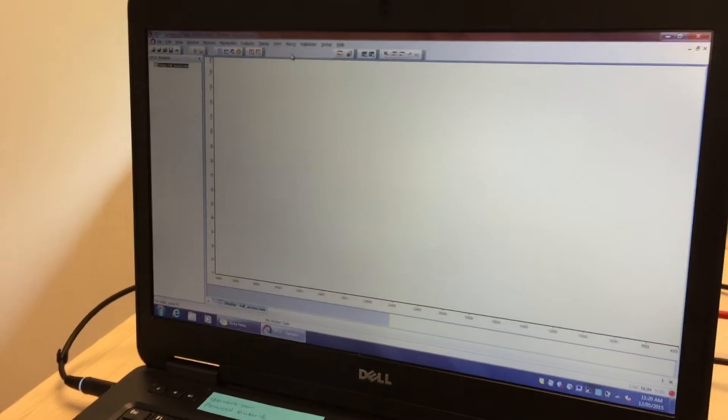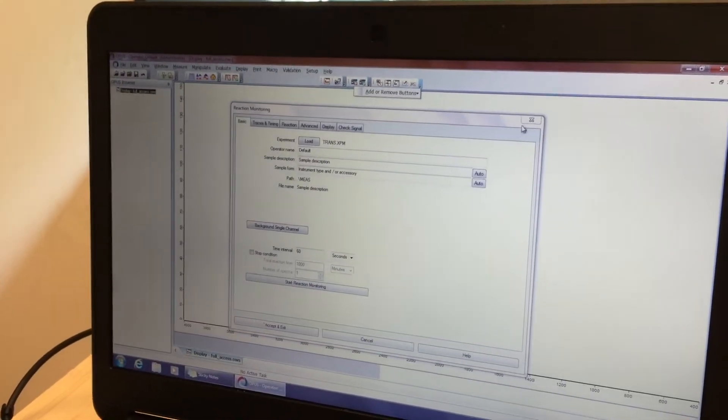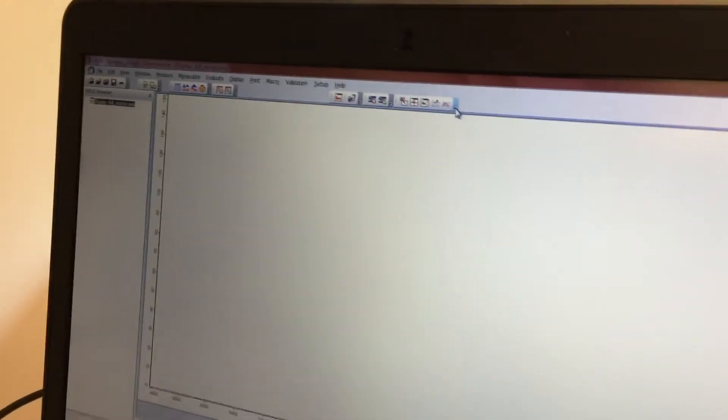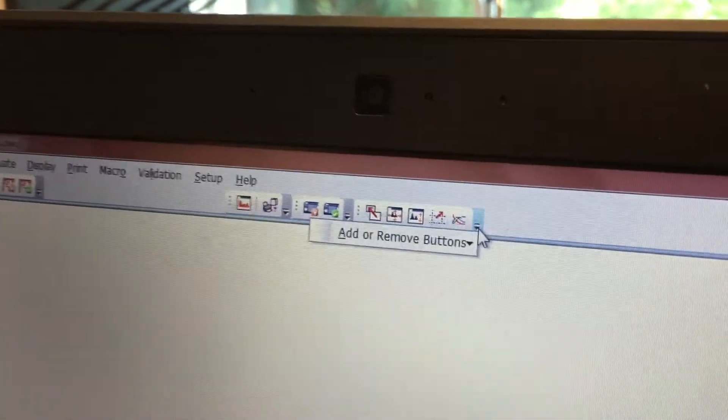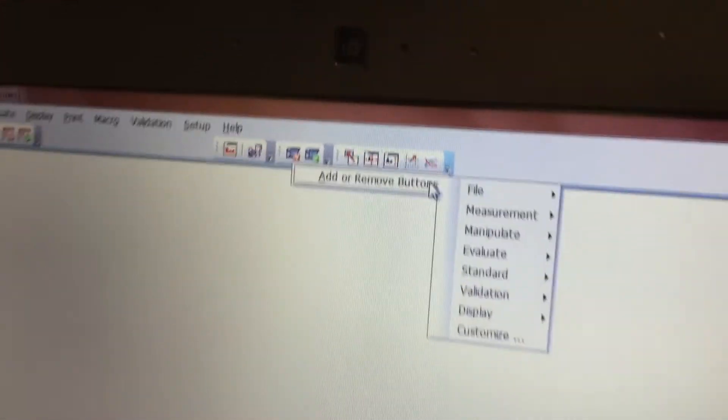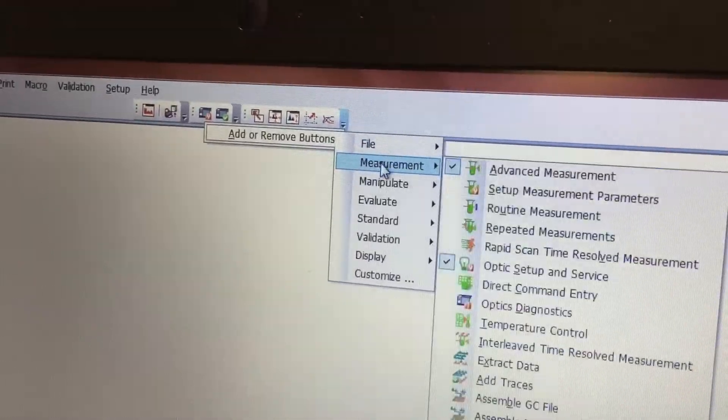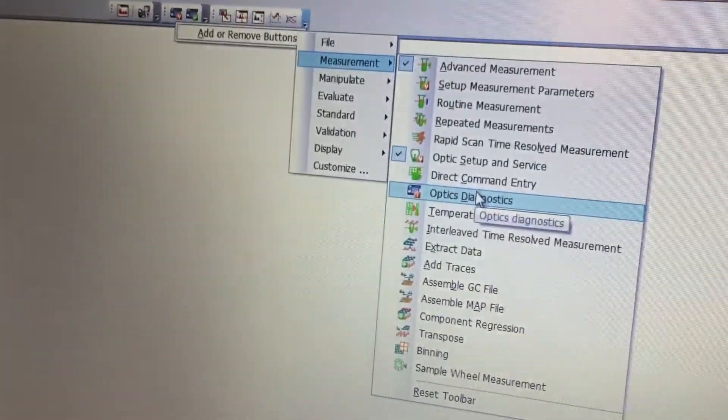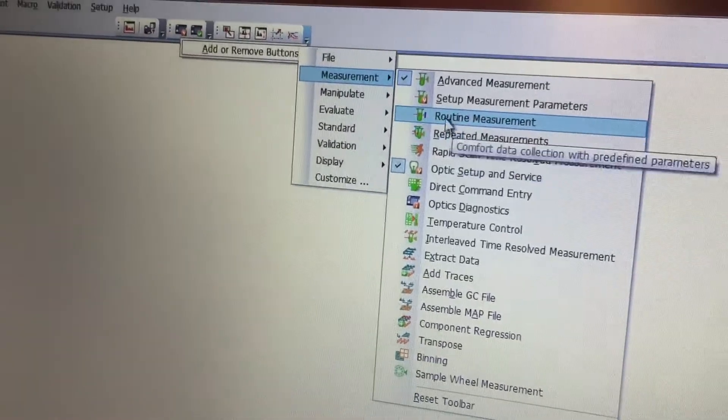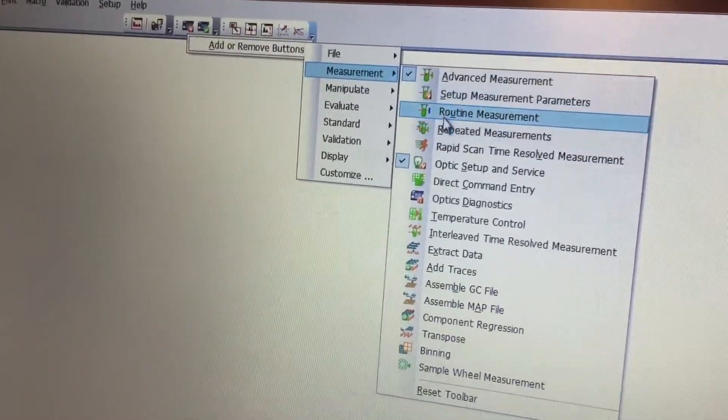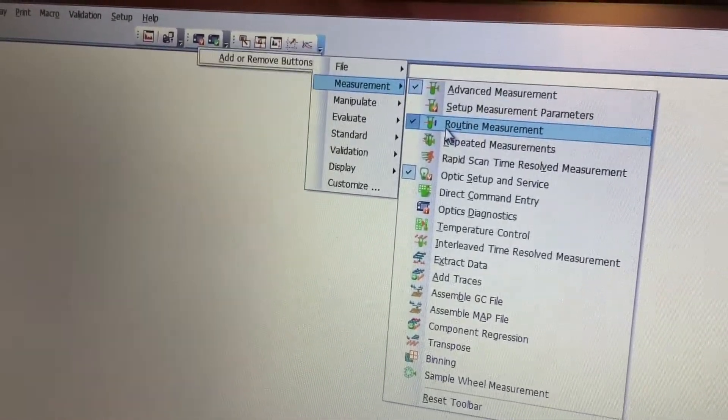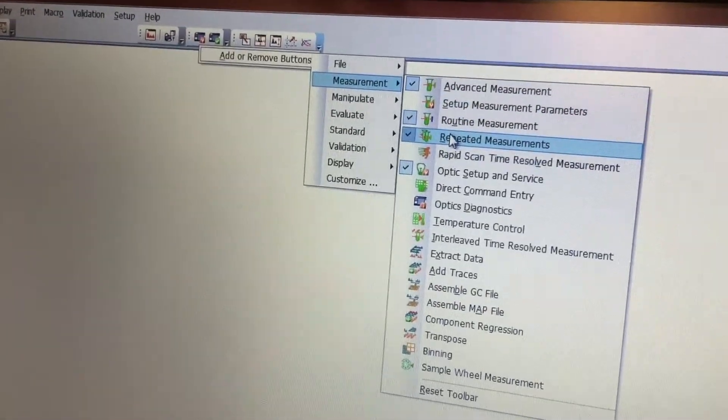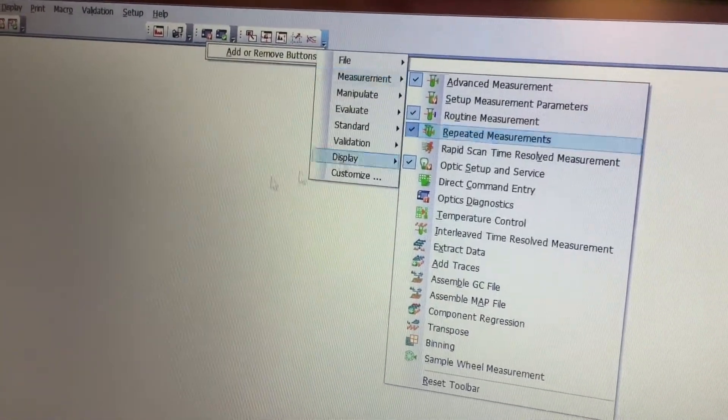We're going to add a few buttons. There's a little arrow there. I'm pressing on customize, add or remove buttons. Let's add measurement buttons, let's add the routine measurement. There it is. And we'll also add repeated measurement. Great.